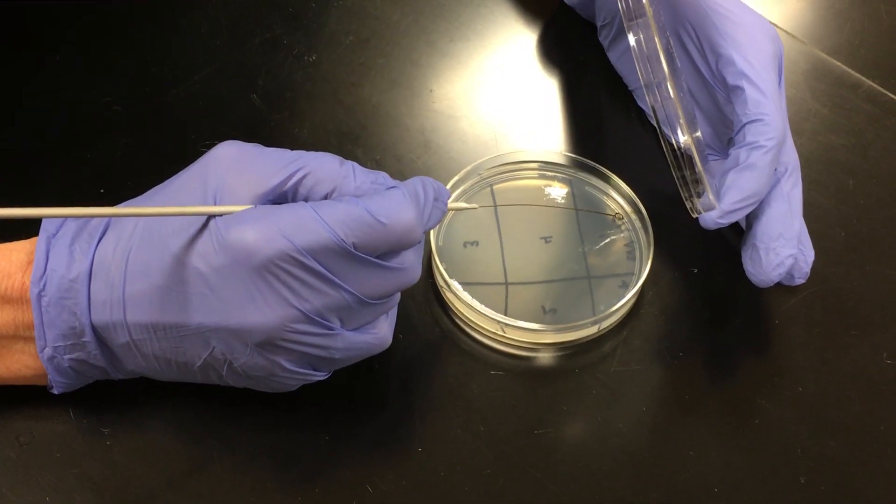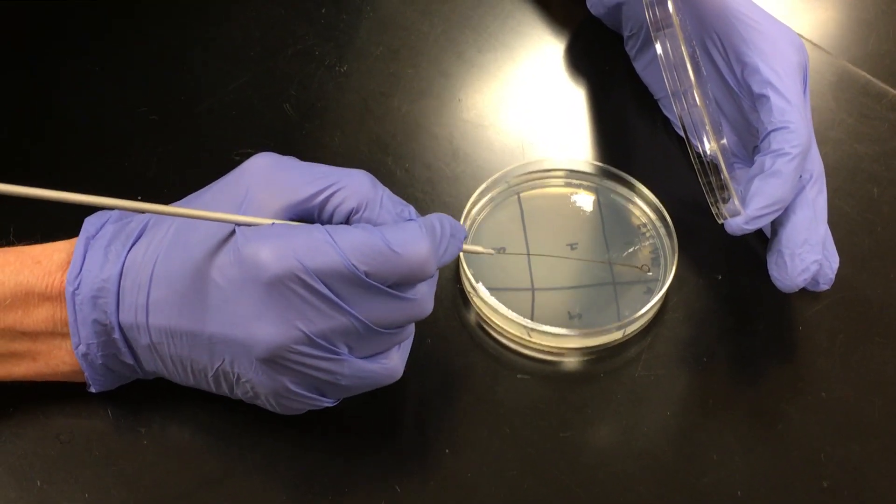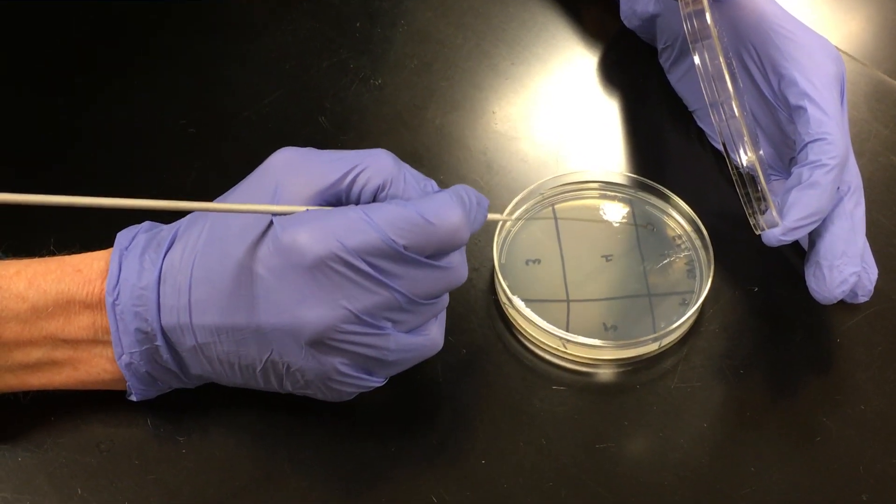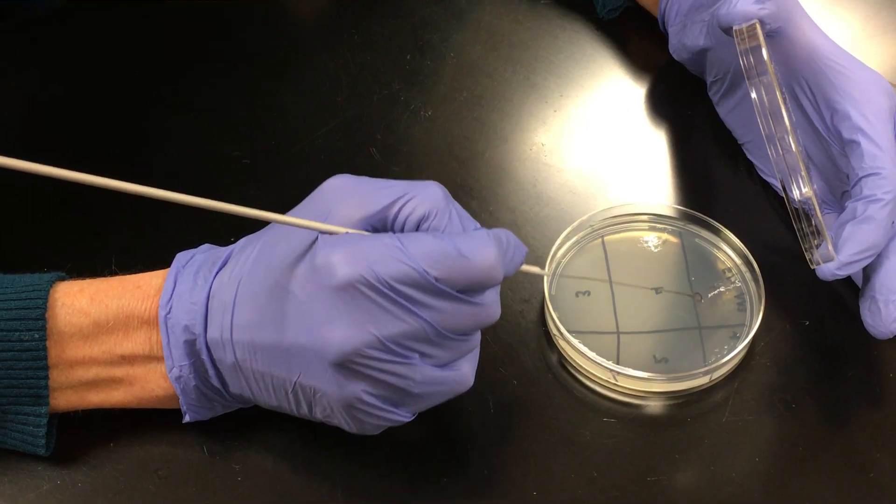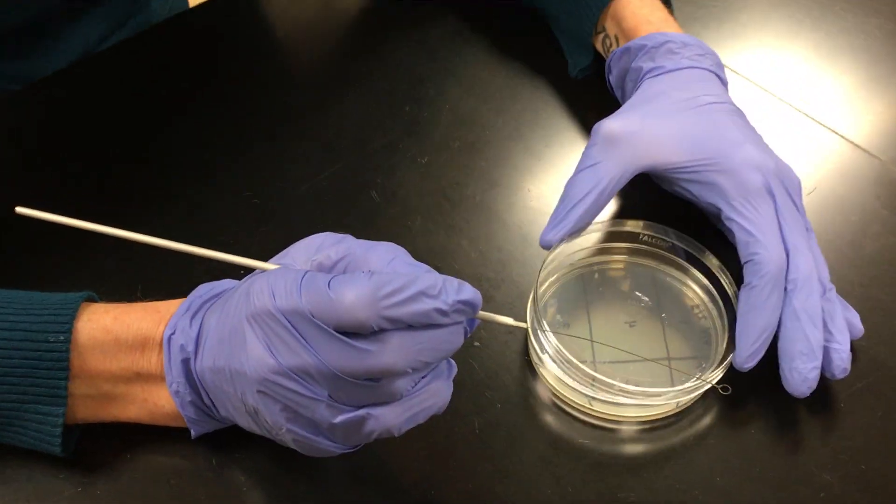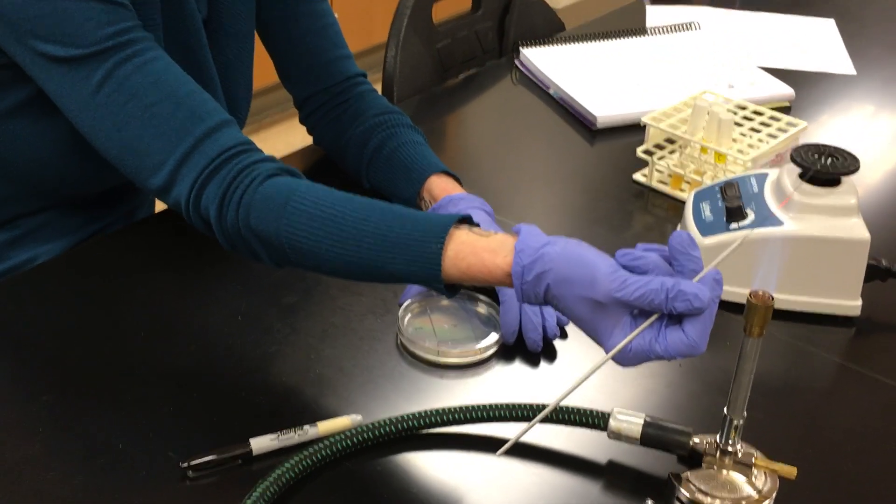And I'm going to start up here at the top and gently touch my loop to the agar surface. And then I'm going to start streaking. And I never want my lines to cross over one another. I'm just going to go back and forth. One, two, three, four, five times. And then I'm going to stop. You don't want to cross into any of the other quadrants.